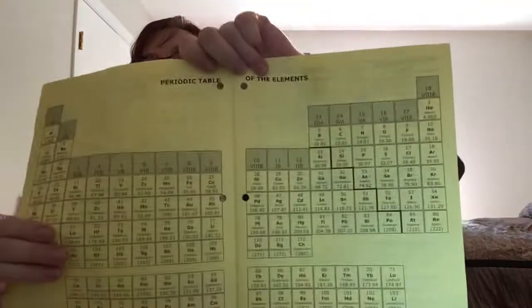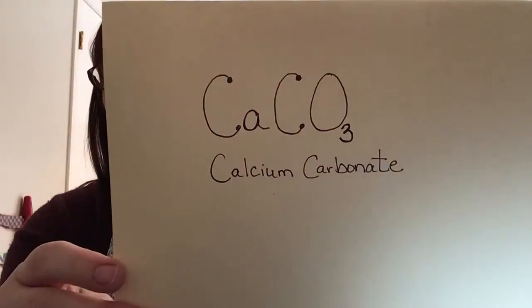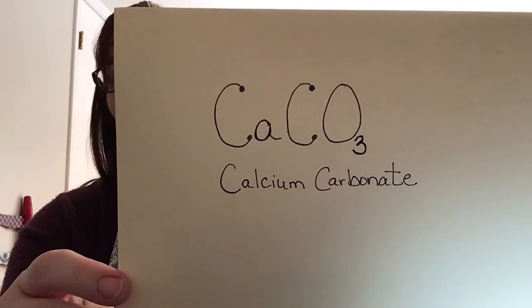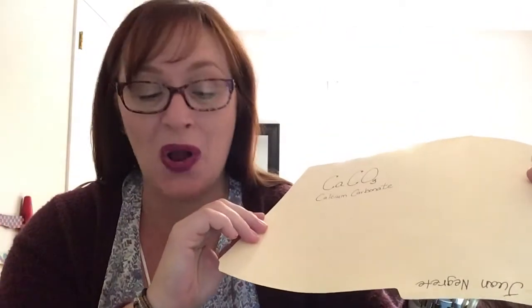Hi chemistry kids, Ms. Venable here bringing you a video lesson today and we're going to do a little lab experiment. You will need a piece of chalk, an electronic balance, your periodic table, and the chemical formula for chalk which is CaCO₃. The chemical name of that chalk is calcium carbonate.